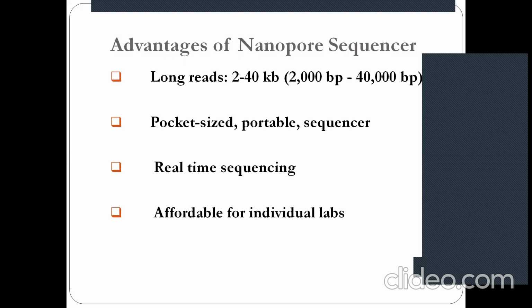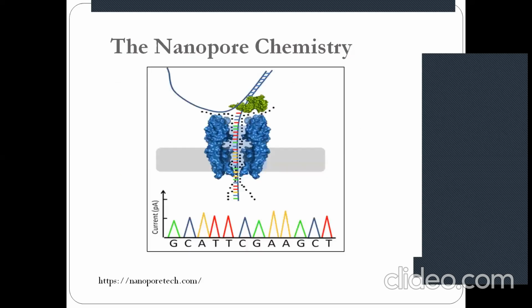Once you buy this kit, they will also provide you the cleaning kit, so you can clean it as well. This is basically the chemistry of the nanopore. Here we have a cassette. In the cassette you have this nanopore.